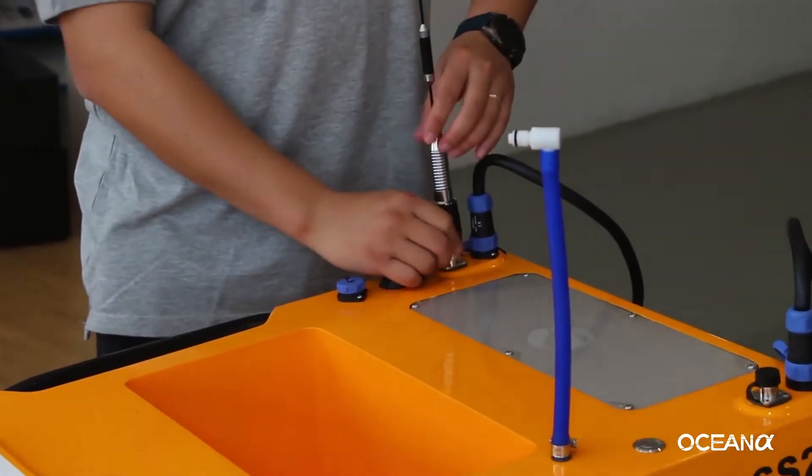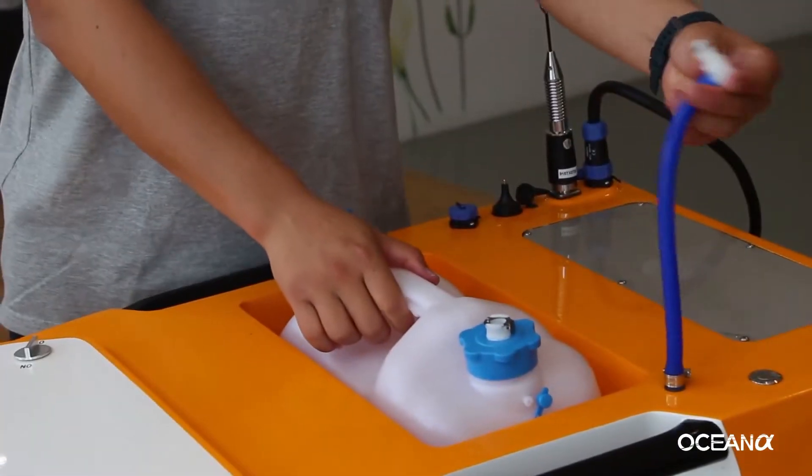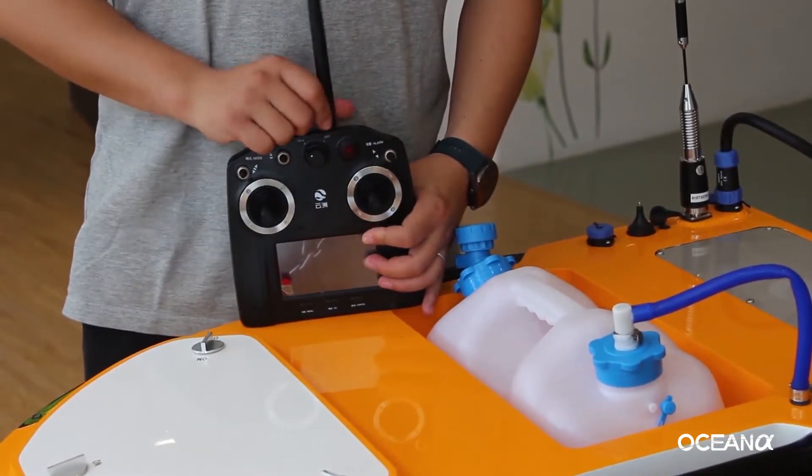Install the antenna. Install the sampling bottle. Install the remote control antenna.